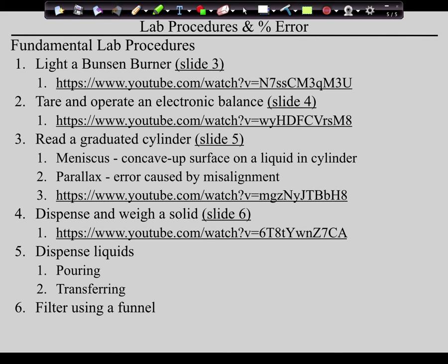You're going to fold this twice, and then you're going to tear a corner. Then, guys, what you're going to do is this. Let me make this really stand out. If you then look at the filter paper from the top, you will notice that there are 4 pleats. But you will notice that 2 of the pleats are torn, and 2 of the pleats are not.